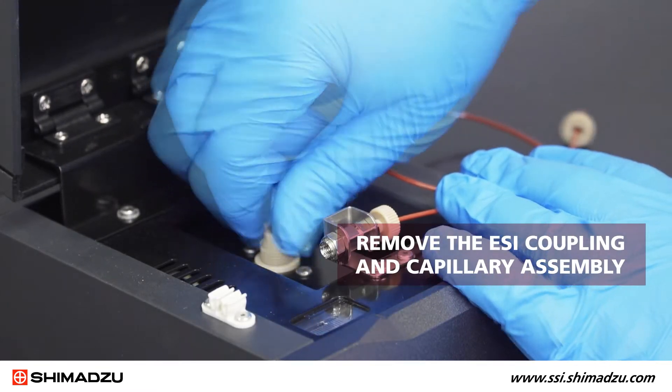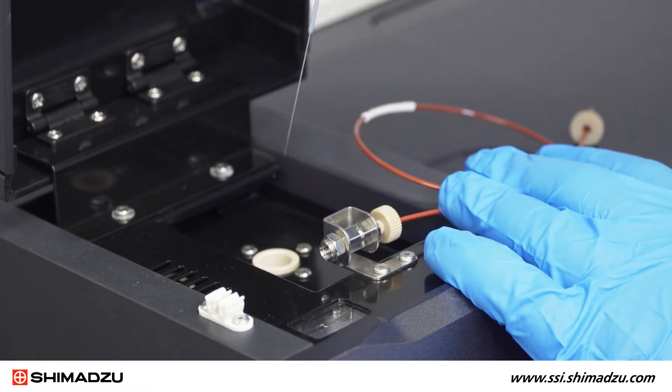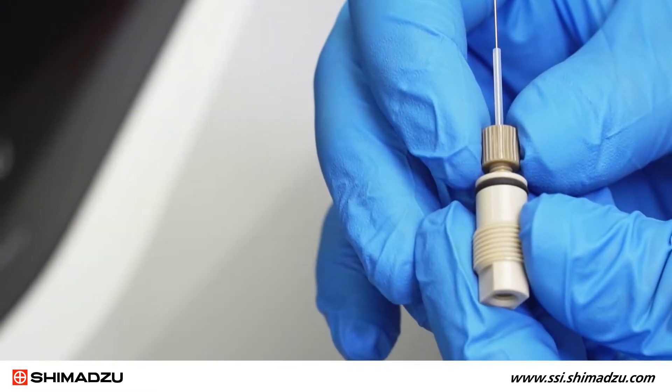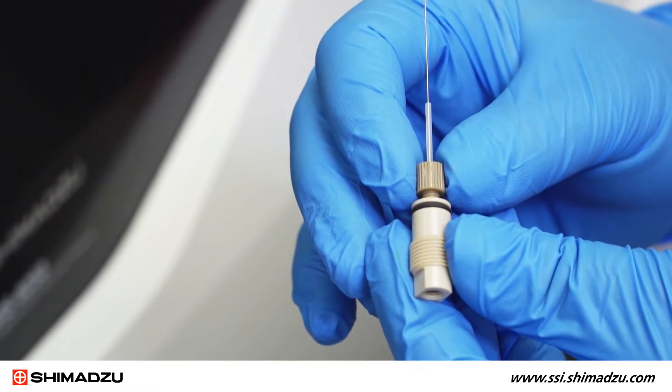Next, remove the ESI coupling and capillary assembly by turning it counterclockwise and lifting it straight up from the source. Once the entire assembly has been removed, you need to disconnect the ESI coupling from the capillary assembly.